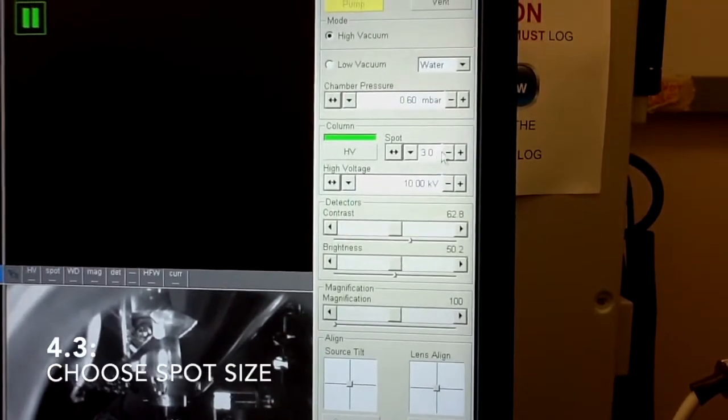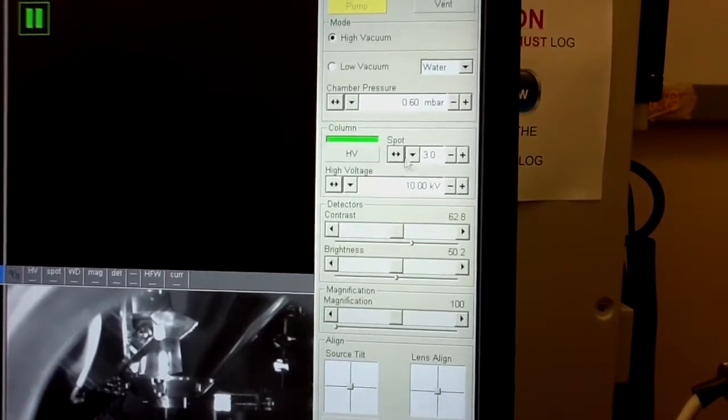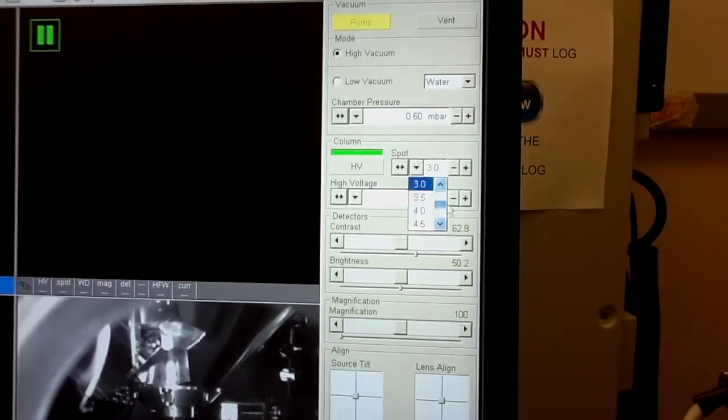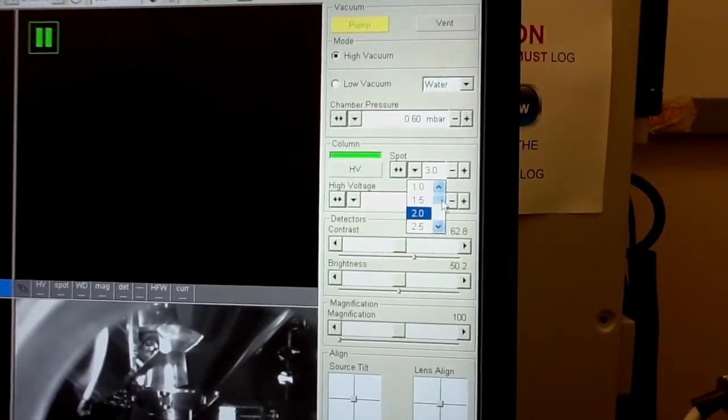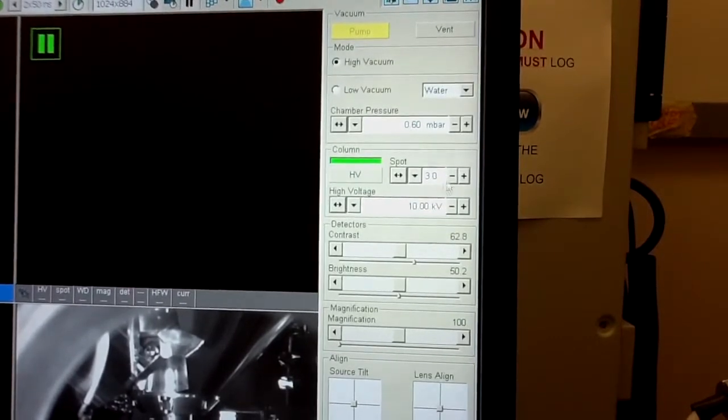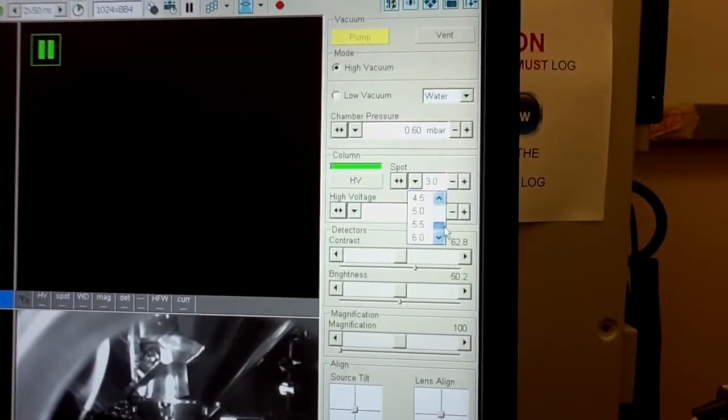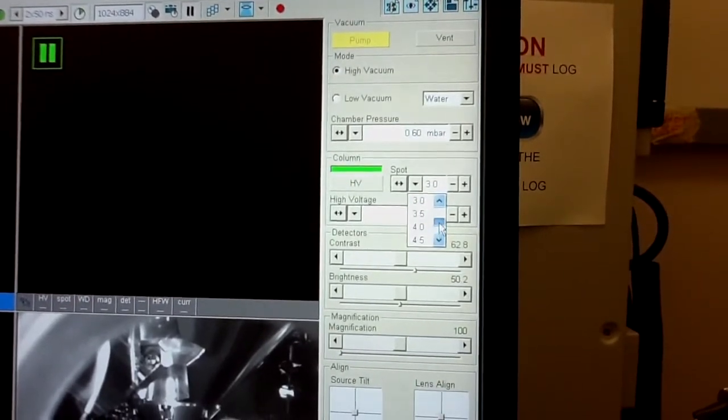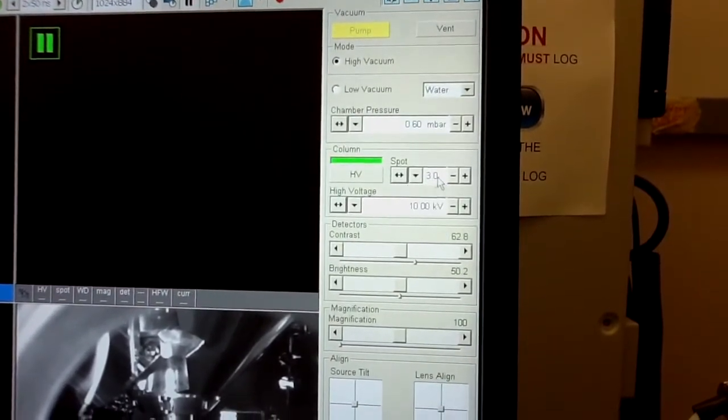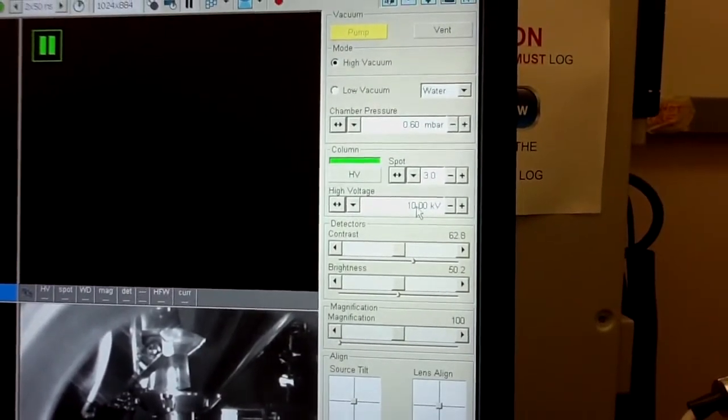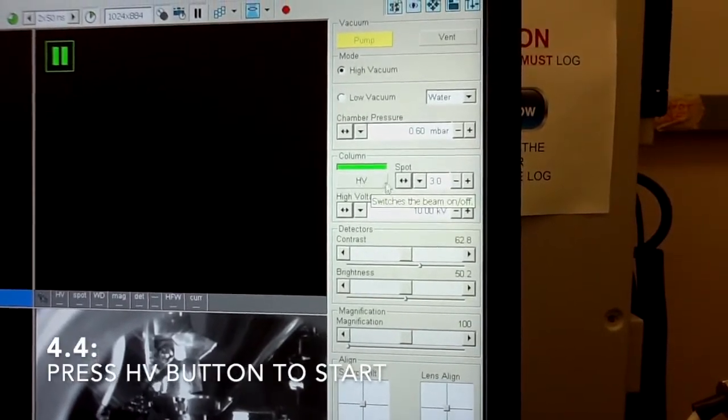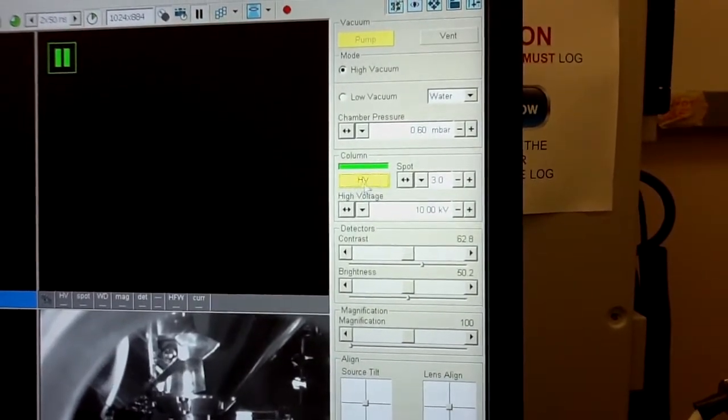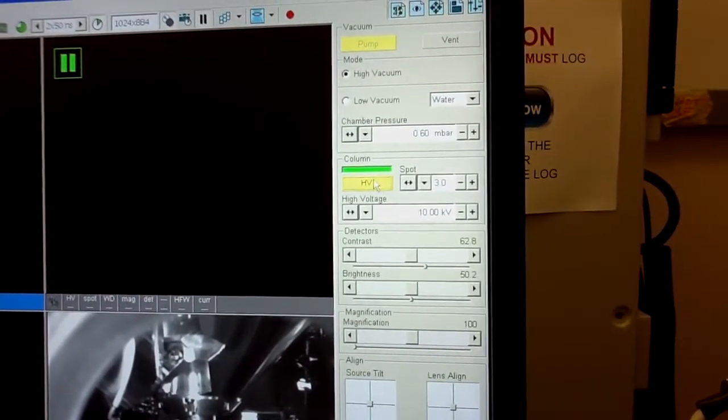Spot size of three is probably a good one to start as well. But you have a lot of options. So the smaller the number, less intensity will have. So don't go to too low number. On the other hand, higher the number means resolution is worse. So don't go to six because resolution will be very poor. So three is a good number to start. Once you are ready, you selected your high voltage value and spot size. You can click high voltage button and it should turn yellow, which means the high voltage has been applied.